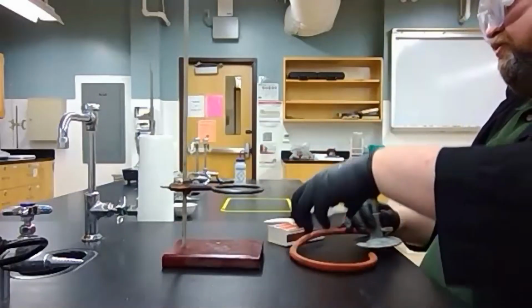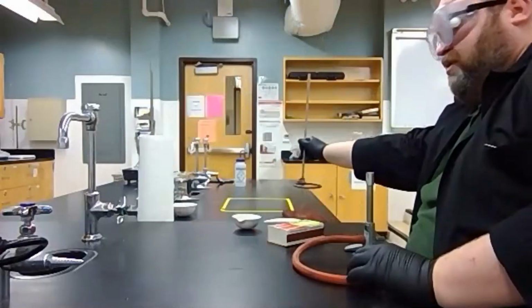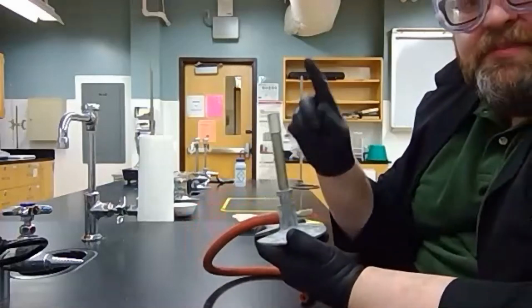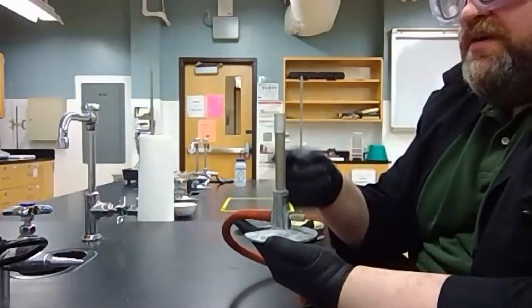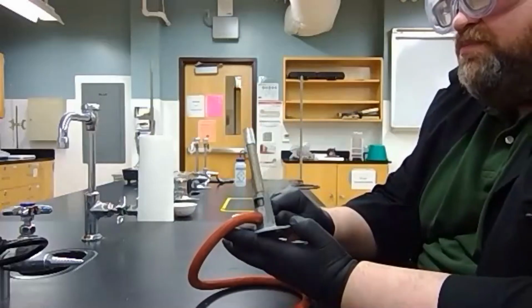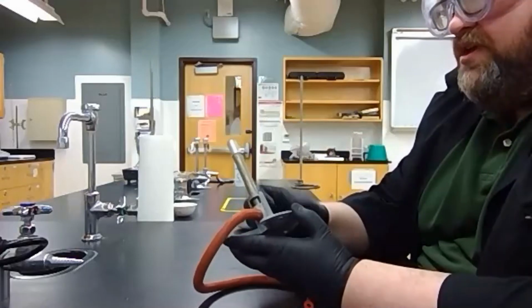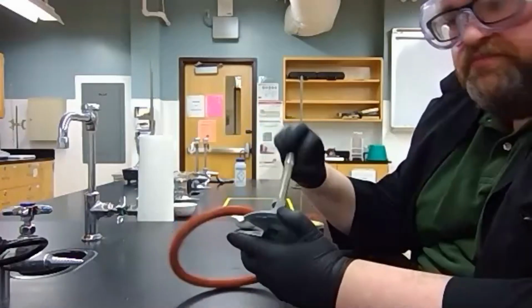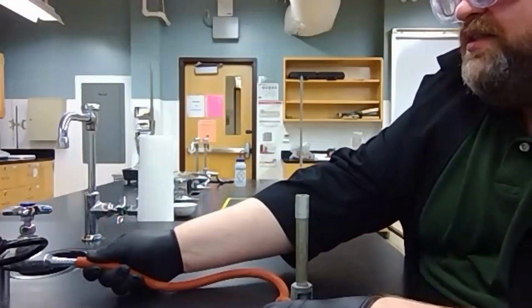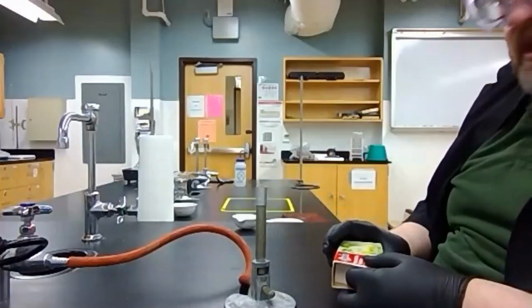So I'm going to move everything to a safe location away from my Bunsen burner because I don't want fire on anything else. And remember to safely use the Bunsen burner. We've got the bell and we've got the gas inlet. We're going to close both of those off completely, and then we're going to turn both of them 2 big turns. Once we've done that, we're going to connect this to our gas line, and now we're ready to introduce fire to the situation.